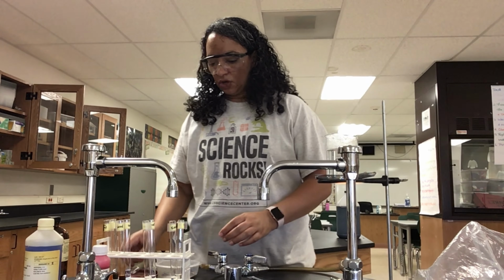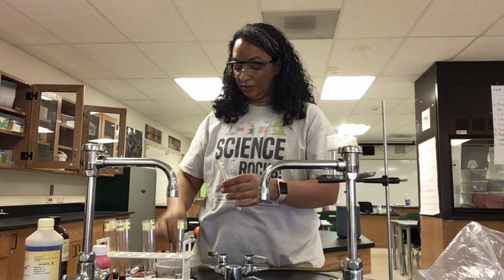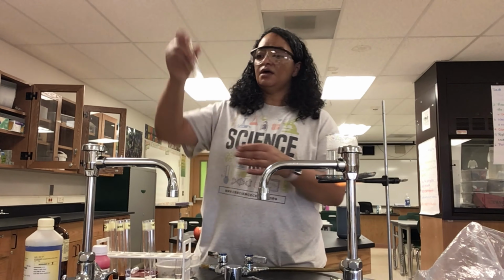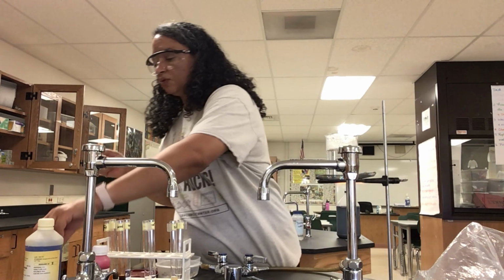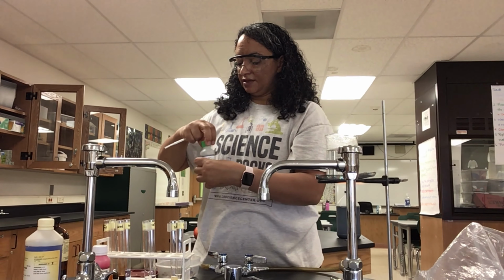Okay. So I'm going to find my seed, and I'm going to put a little bit of seed in there, seed paste. Get a nice chunk of seed paste for that. And I'm going to mix it up, nice and mixed. Then I'm going to get a new pipetter, and for this test we're using what's called Benedict's solution. So I'm going to unscrew the lid on that.